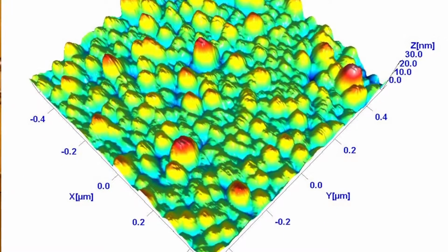Fundamental principles that we use in the laboratory include, for reaction engineering, we can study the porosity and tortuosity of porous materials such as reaction catalysts or supports. Further, we can study the mass transfer of materials. So, for example, we can look at the moisture uptake and desorption of materials by exposing them to certain humidities and temperatures and monitor the change in mass as a function of time.